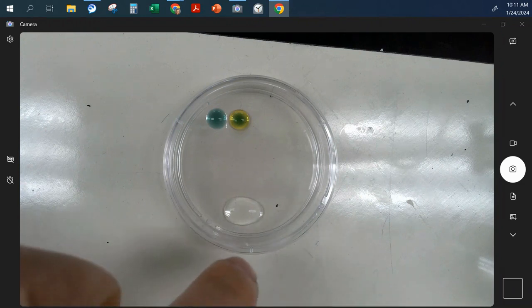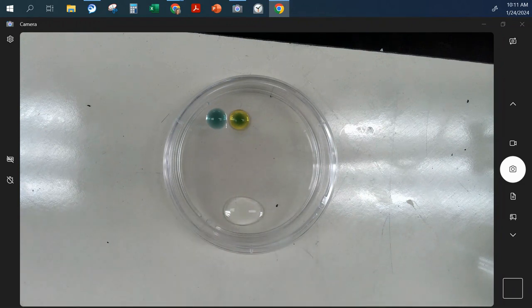You have to decide as a group, when am I going to start the timer? When am I going to stop the timer? And also, I just did 3 of each drop. Are you going to modulate the amount of drops? Like, are you going to do 1 of these drops and 5 of these drops? That could be for concentration.